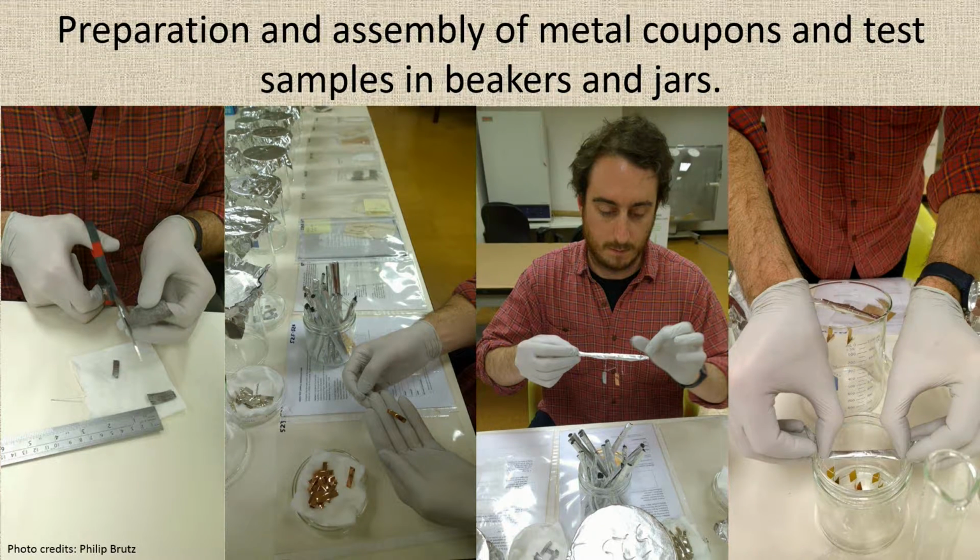I hold off on preparing the metal coupons until the end of test prep because I want them to be as corrosion-free as possible at the start of the test. First, I degrease them with naphtha, reagent-grade ethanol, and acetone, except for the lead coupon, which is degreased with xylene in place of acetone. For the copper and silver coupons, I first use 1 micron alumina until all of the corrosion is removed from the metal. Then I clean polish residue from the coupon using an ultrasonic cleaner with deionized water.